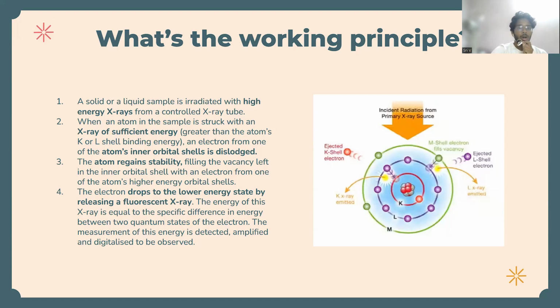The absorption of X-rays by a particular material varies according to the energy of the X-rays. As a rule of thumb, low energy X-rays are absorbed more than high energy photons. In order to expel an electron from one of the orbitals, the X-ray energy must exceed the binding energy of that electron. However, if the X-ray energy is too high, then the coupling between X-ray and electron is inefficient and only a few electrons will be knocked out.